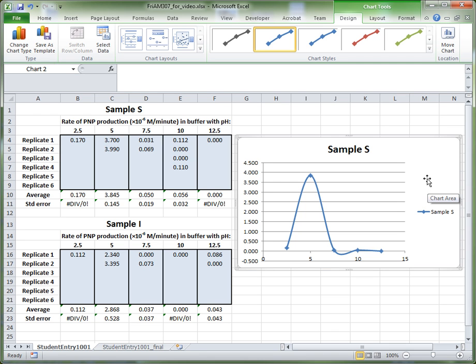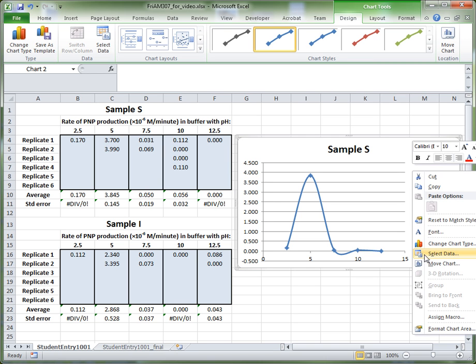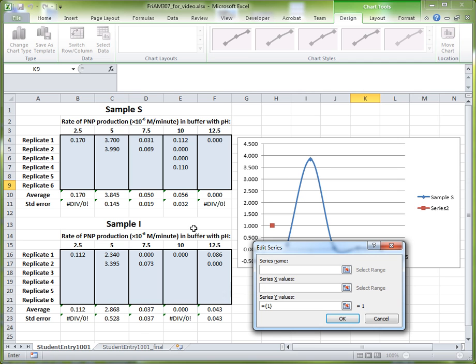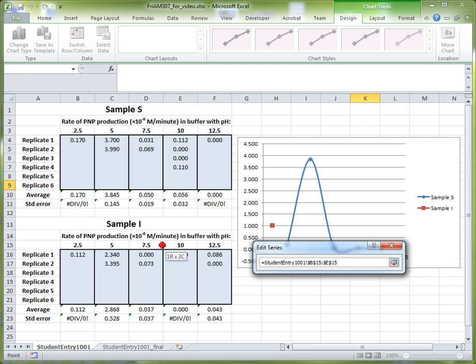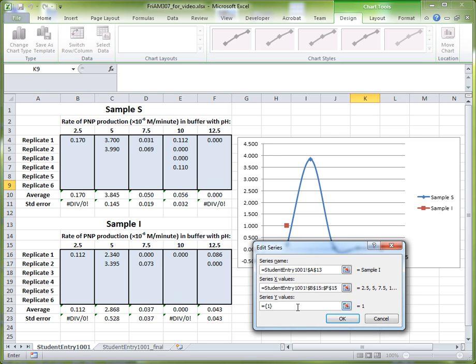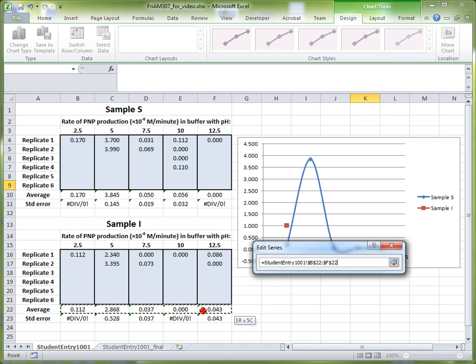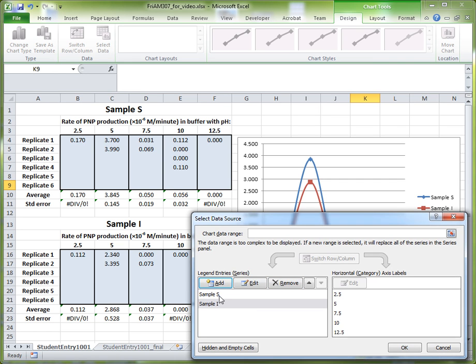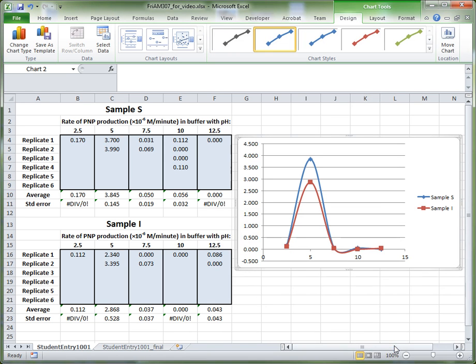Now we want to plot sample I onto the same graph. Right-click onto the graph and choose Select Data. Again we want to add the next series, so click the Add series button. Give it the name — Sample I is the name. The X values again would just be the pHs, 2.5 all the way to 12.5. Click into the Y values box, clear the numbers that are there already, and then select the average rate of PNP production for sample I. Click OK. Now we have our sample S series and our sample I series selected, so click OK to close the box.